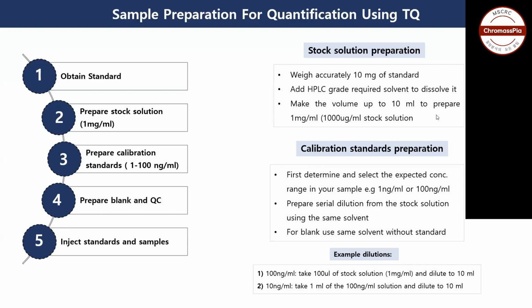So today we will have a session for the triple quadrupole mass analyzer, and this will be the last session of this triple quadrupole mass analyzer. In this one, I will tell you about the preparation of the sample for analysis, and after that, how we can draw the calibration curve using the triple quadrupole mass analyzer and the experiment, and how we can perform the quantification using our LC analysis, which we have performed previously in the MRM method.